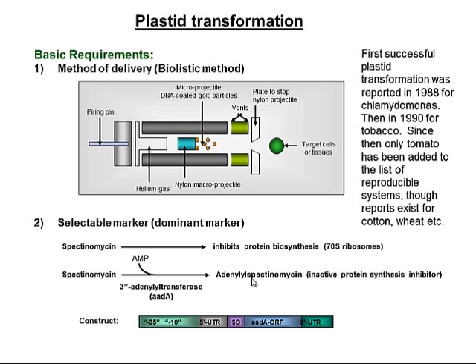And you can see here the construct of the gene. So the construct has the -35 to -10 region, which is the promoter region, and also a region where you find the Shine-Dalgarno like ribosomal RNA binding site.